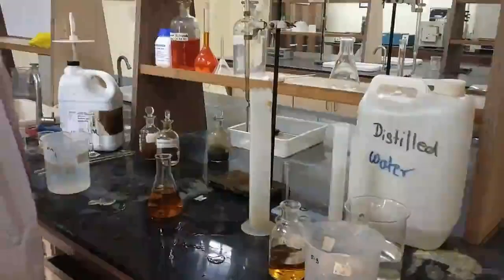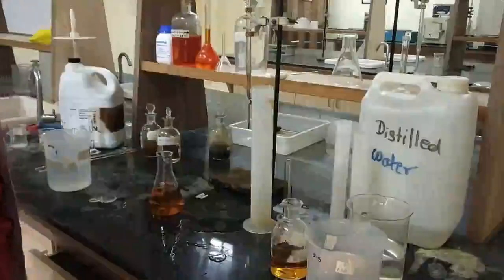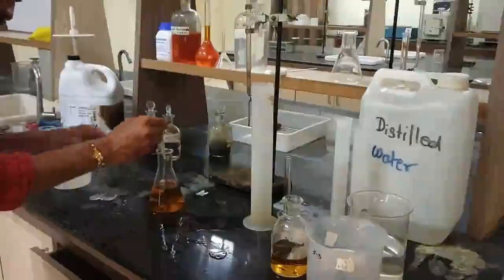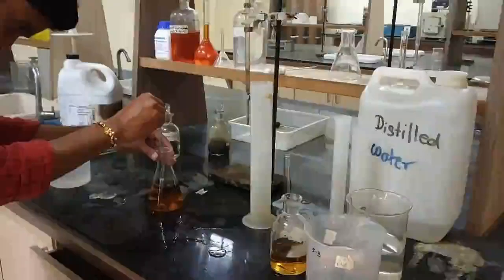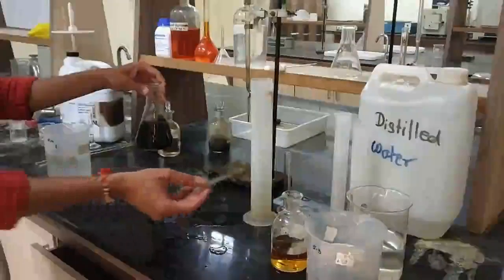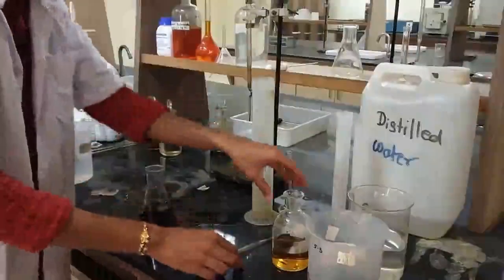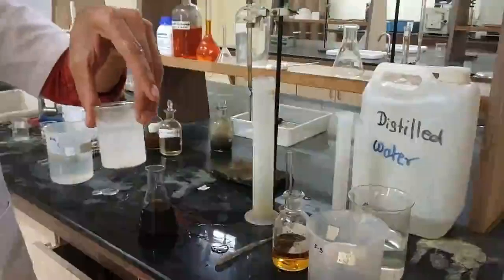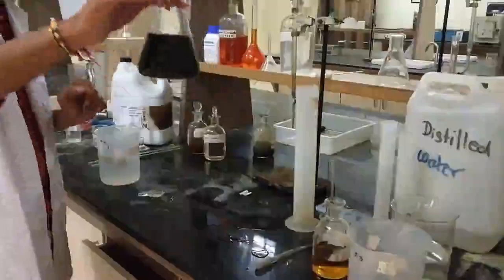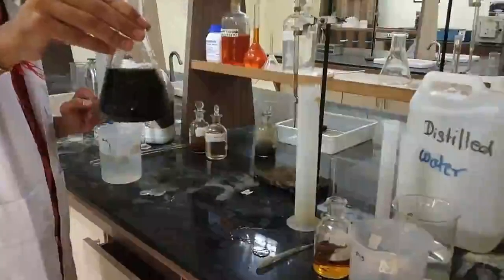We are going to add it with the help of the dropper. You can show the starch beaker. Yeah, you can see the color change. It has turned blue. Check it well. Akshay, please show the starch indicator beaker. This is how the starch indicator looks like. Now you can see the bluish color that is obtained slightly on the higher side.